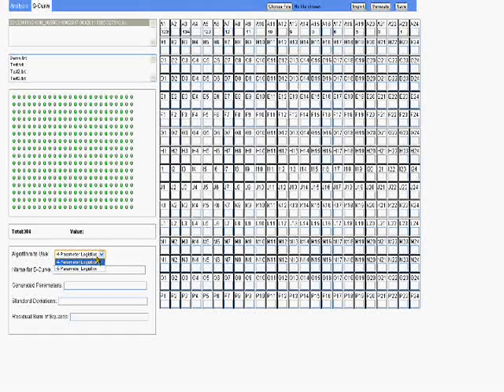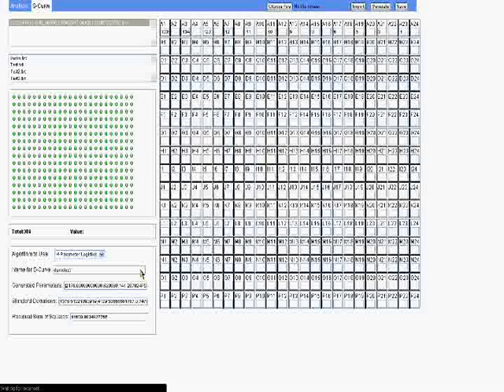And so you can either select a 4-parameter logistics or a 5-parameter logistics. Once you've selected that and you've imported the values, you can name the curve, and then you generate it if you'd like to see the values first. So here you can see its values. You can use these to decide if you want to use that one, or you can use the 5-parameter logistics and generate that and compare the two values.